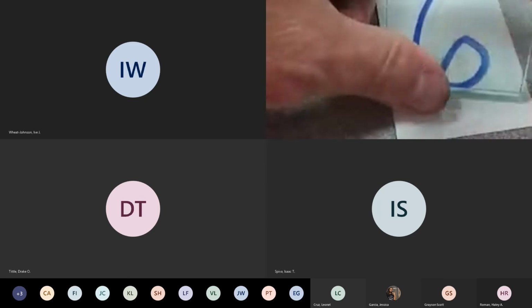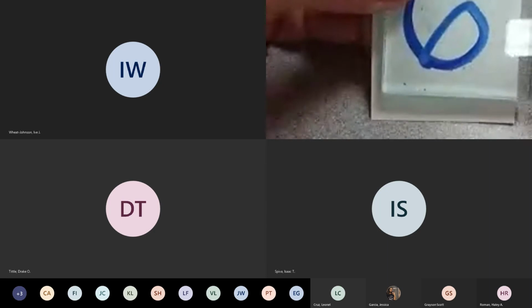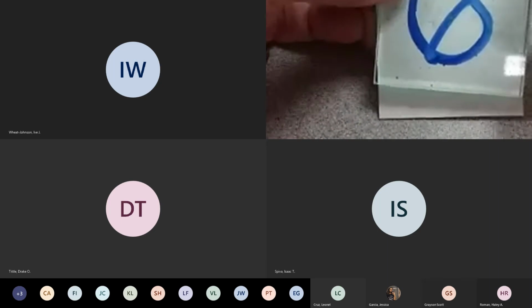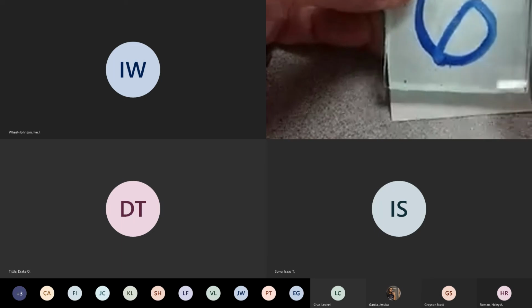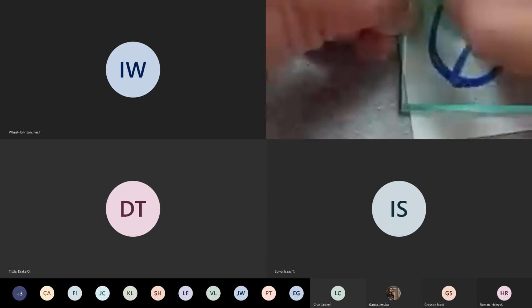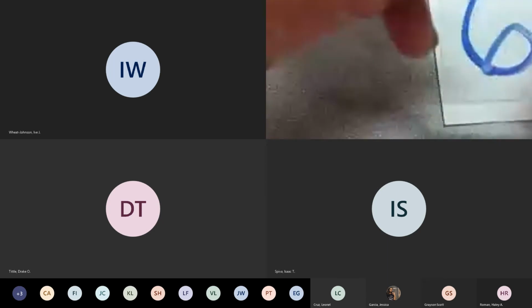It looks like I did catch something right there briefly. So let me just say that sometimes there are more than one mineral on here, and I think there's something else on here that I caught, because most of the time I am not cutting the glass with this.